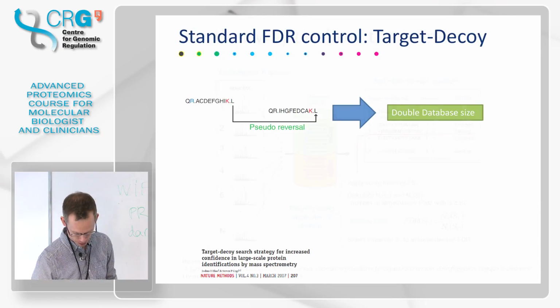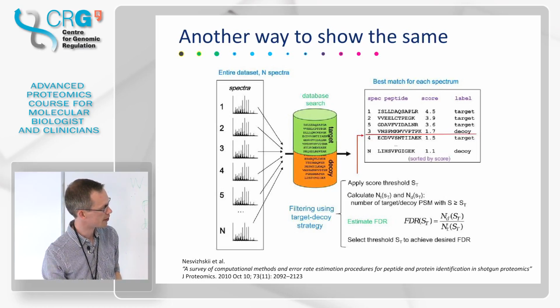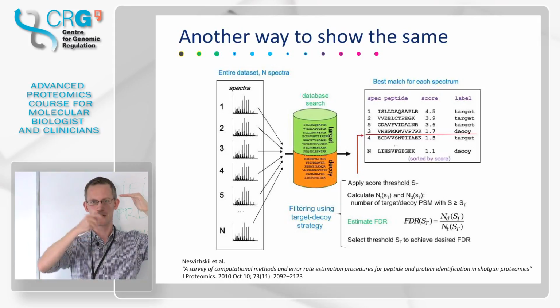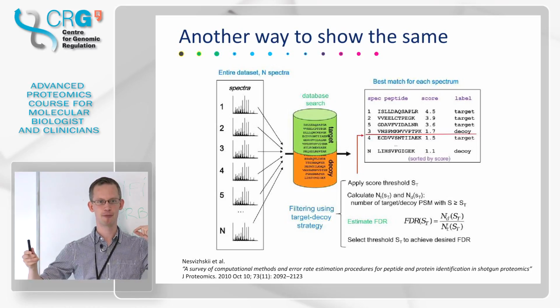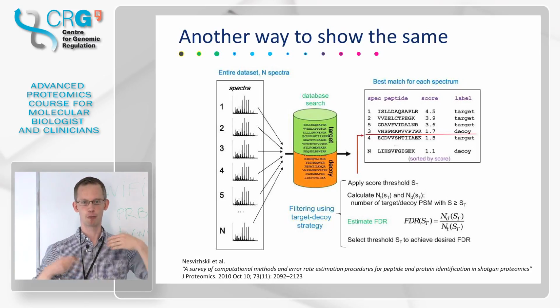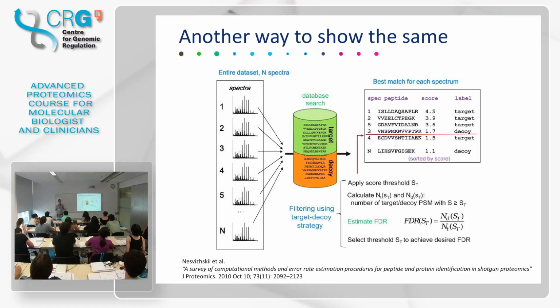then for some you get a target assignment, and for some you get a decoy assignment. You know this one came from the decoy database, because you're keeping track of which proteins are reversed and non-reversed. So which peptide matches are best explained by a peptide from the reversed side compared to the forward side. It's important to understand this, because this is a fundamental approach to how we control errors in shotgun proteomics. If anyone has any questions, maybe, then I can answer them. Who understands this?